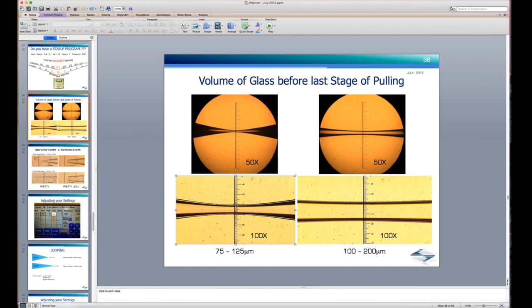So basically what you want to do in this situation is write your program so it's stable in hot conditions. And that would be the best advice. I mean, it's hard to struggle with pulling your pipettes when it's cool all the time. So the best thing to do is to write your program so it's happy when the jaws are hot. And that's what I would aim for.